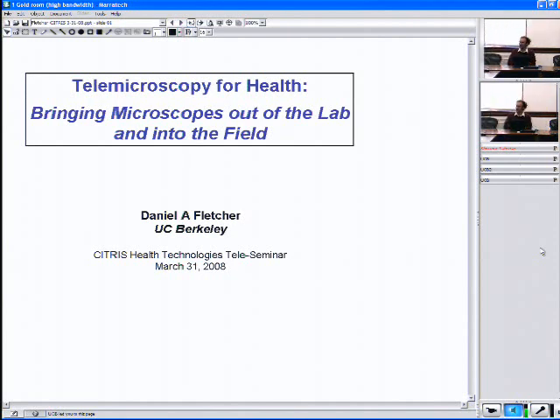Well, we'll have a nice discussion today, and hopefully an interactive one, talking about potential uses for microscopy in telemedicine. What I'll be talking about today are some initial steps we've been making to develop cell phone-based microscopes and present some of our current results and also current thinking about where this project can go.